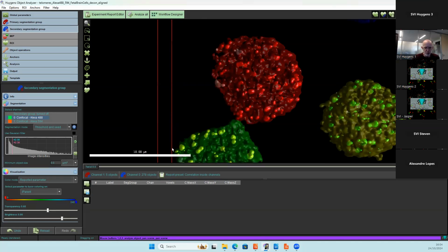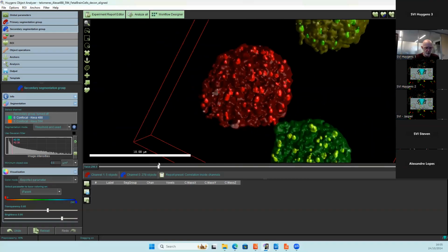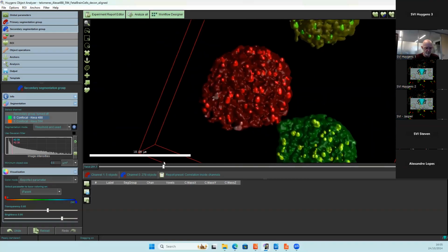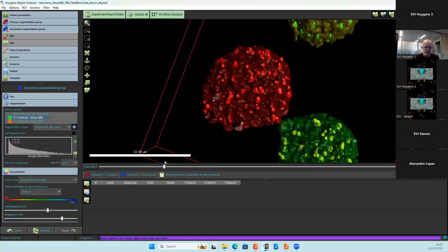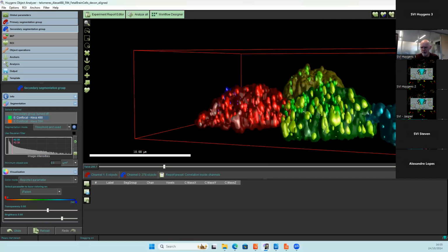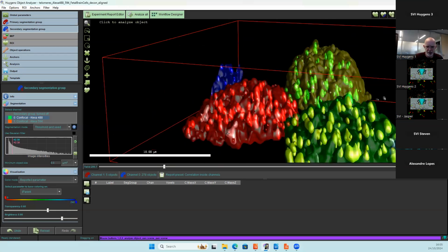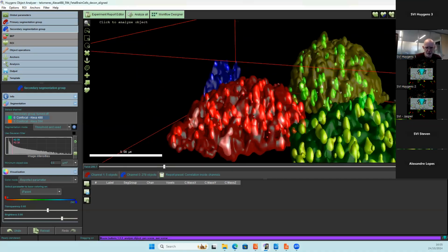What you can do is use the slider just below the scene, grabbing that one and turning it completely to 290 degrees. So we rotate it a bit. Then the twist button here, completely at the right of the scene, we can tilt it to 78, 75, something like that. And now you see already that in this red nuclei, there are two objects clearly, three even, that are gray and not considered as being completely in the nucleus.